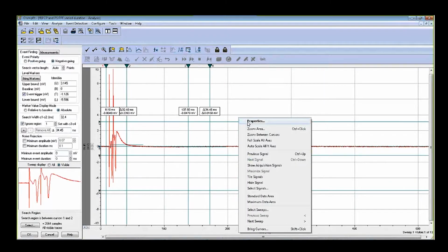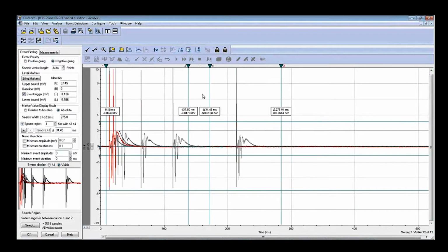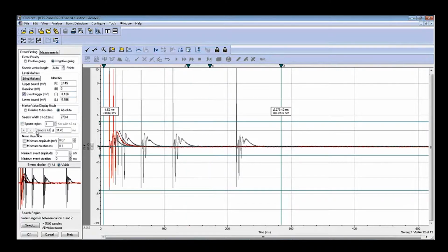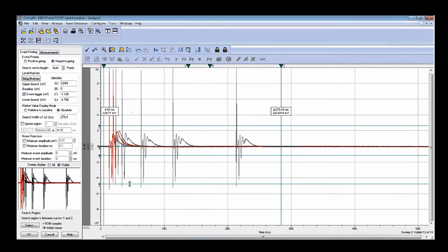Okay, now we just select all of them. Now the total is here. Okay, now again, you can remove all. Now the good thing about this population spike search is that this configuration will save the configuration you did in the previous one, but you can remove them all. Okay, you don't need them. Okay, now you can select again the upper bound and the lower bound. Upper bound is here, and the lower bound is here. This you can select. Okay.